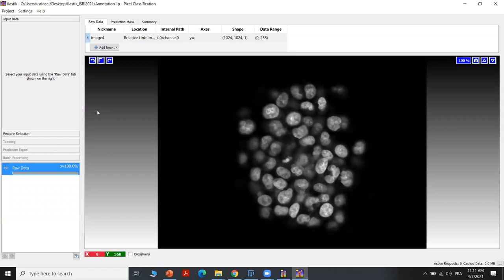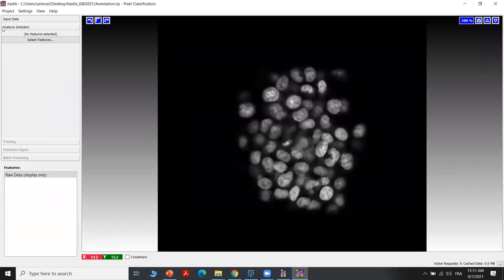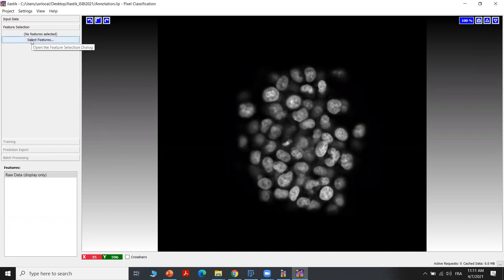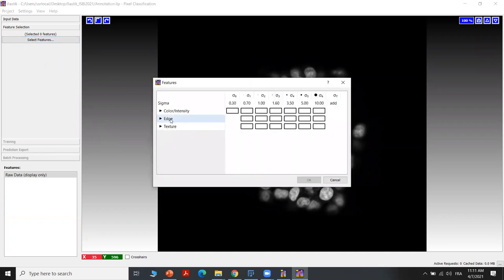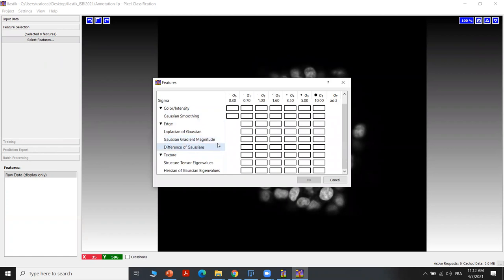After opening this image, we have next to select the features to be used. Because Elastik is based on shallow learning methods, it uses the random forest algorithm. So we have to choose some features to be learned and then used in the pixel classification for annotation. We have several types of features: color features, edge features, and texture features. We can choose all of them or select one or two types depending on our data.